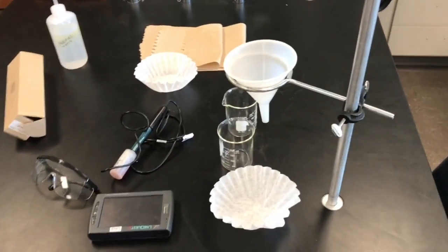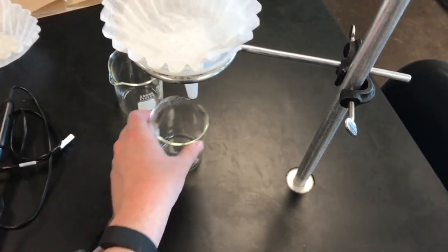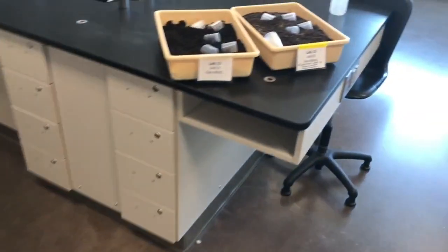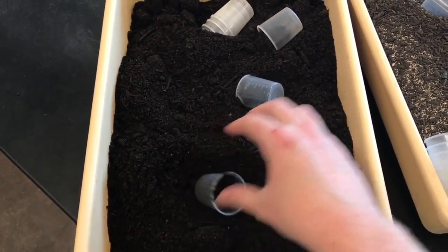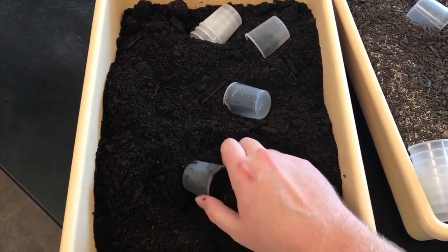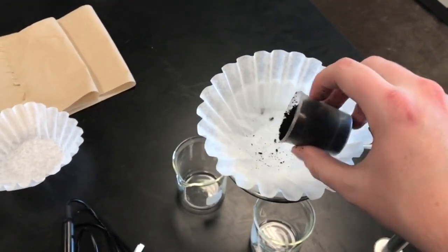All right, so to set up part 1, I have my funnel. I'm going to place a coffee filter in the funnel. Make sure that one of my beakers is right below the funnel. And then I'm going to come over and grab my soil. So you want to grab 2 scoops of soil A. And we're going to pour this right into our coffee filter here.